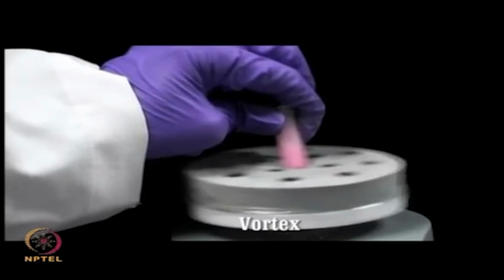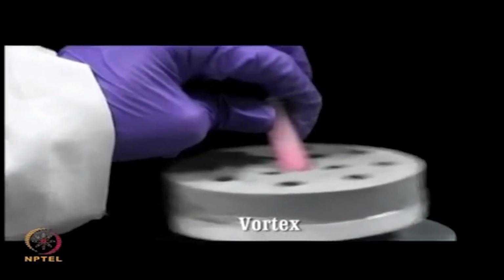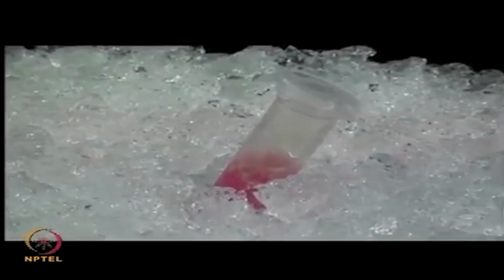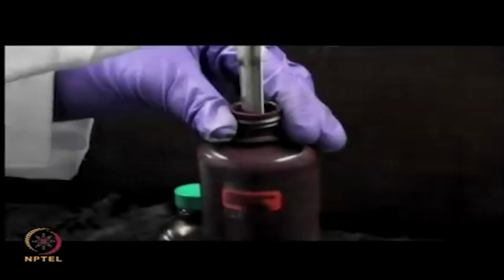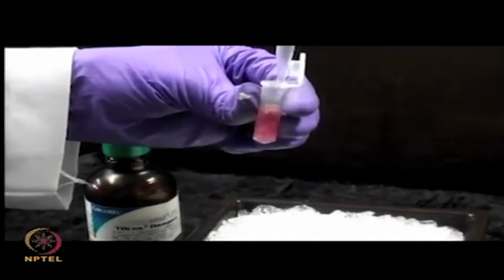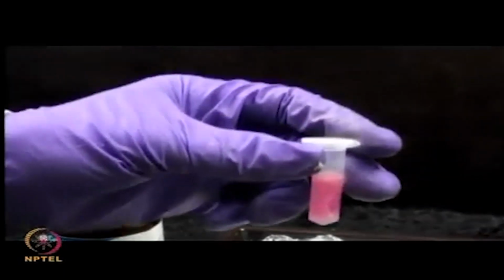Mix the contents thoroughly by vortexing. Next, add chloroform to this solution. Mix the contents and place the tube on ice for a few minutes.